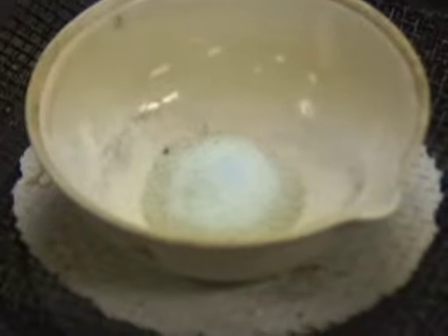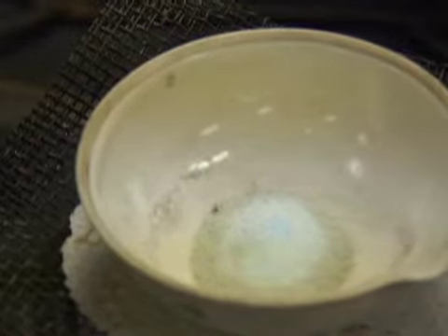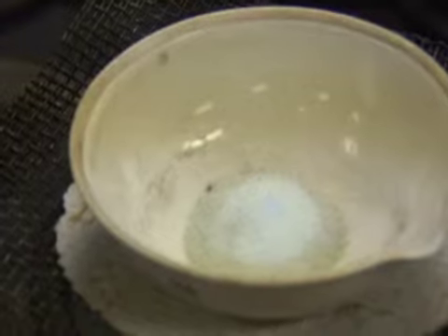Today we're doing the hydrates. Tomorrow we'll do the empirical formula for magnesium chloride. And the last day we'll do potassium chlorate, one of my all-time most favorite compounds. And I can see that this is getting lighter and lighter, and the blue is getting further and further away as all the water is coming out of those crystals.